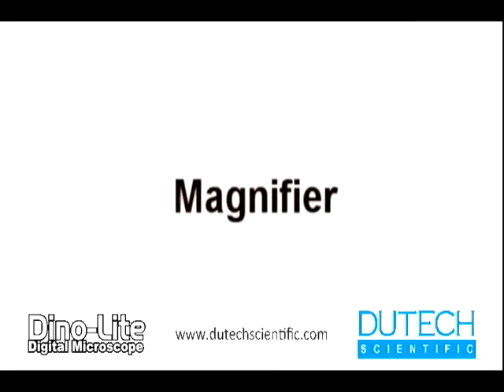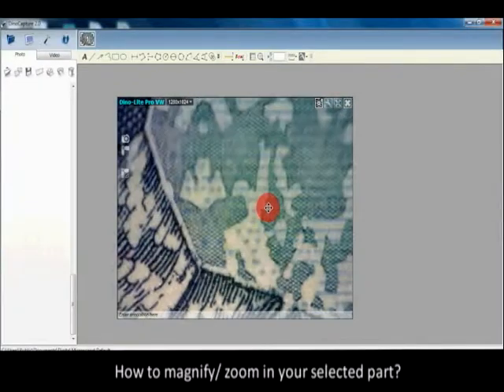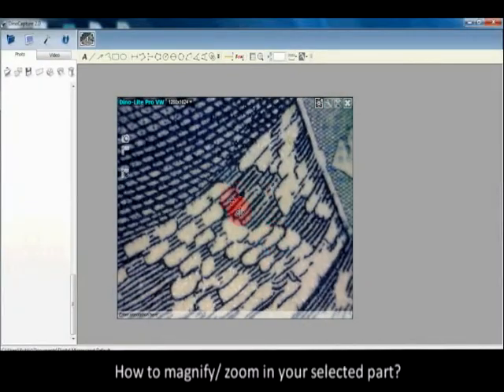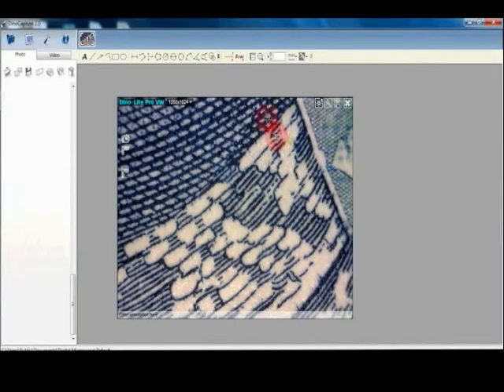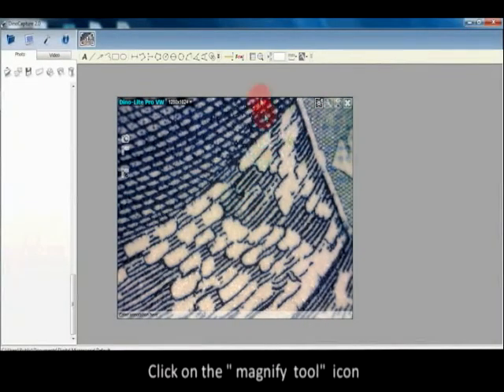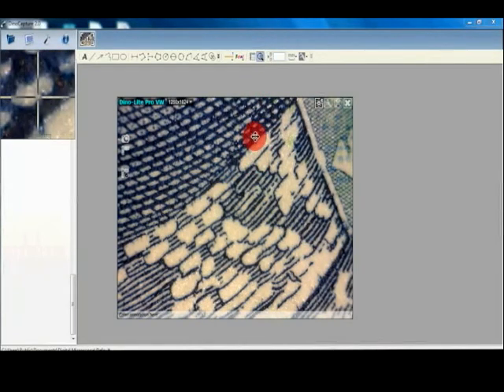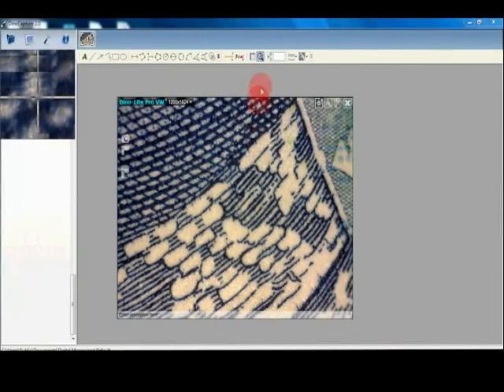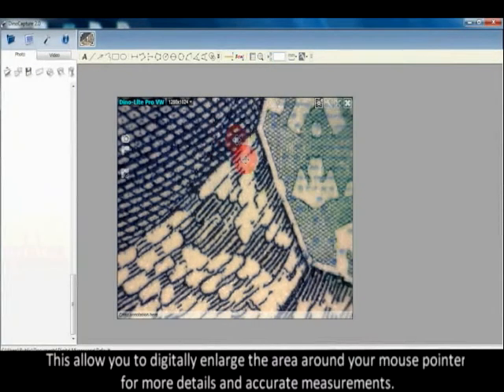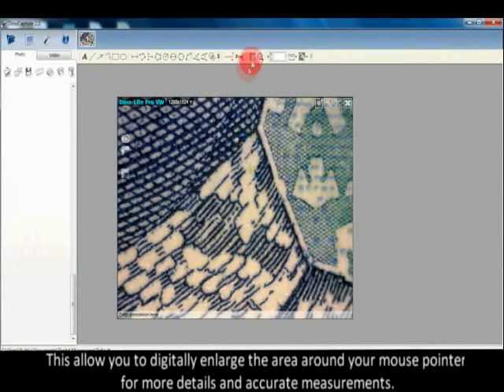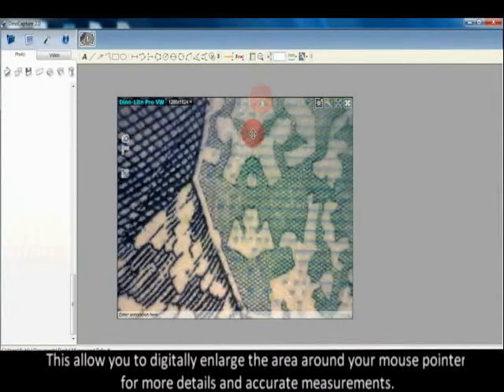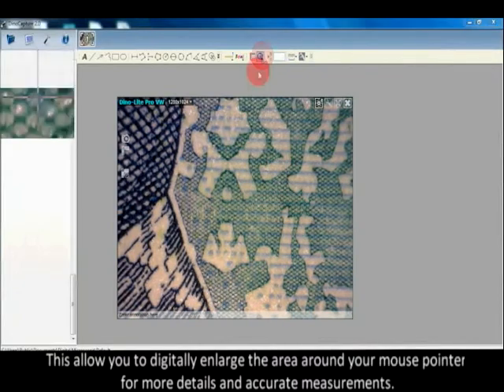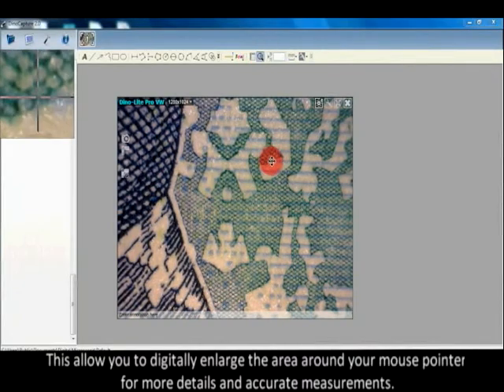How to magnify or zoom in your selected part: Click on the magnify tool icon. This allows you to digitally enlarge the area around your mouse pointer for more details and accurate measurements.